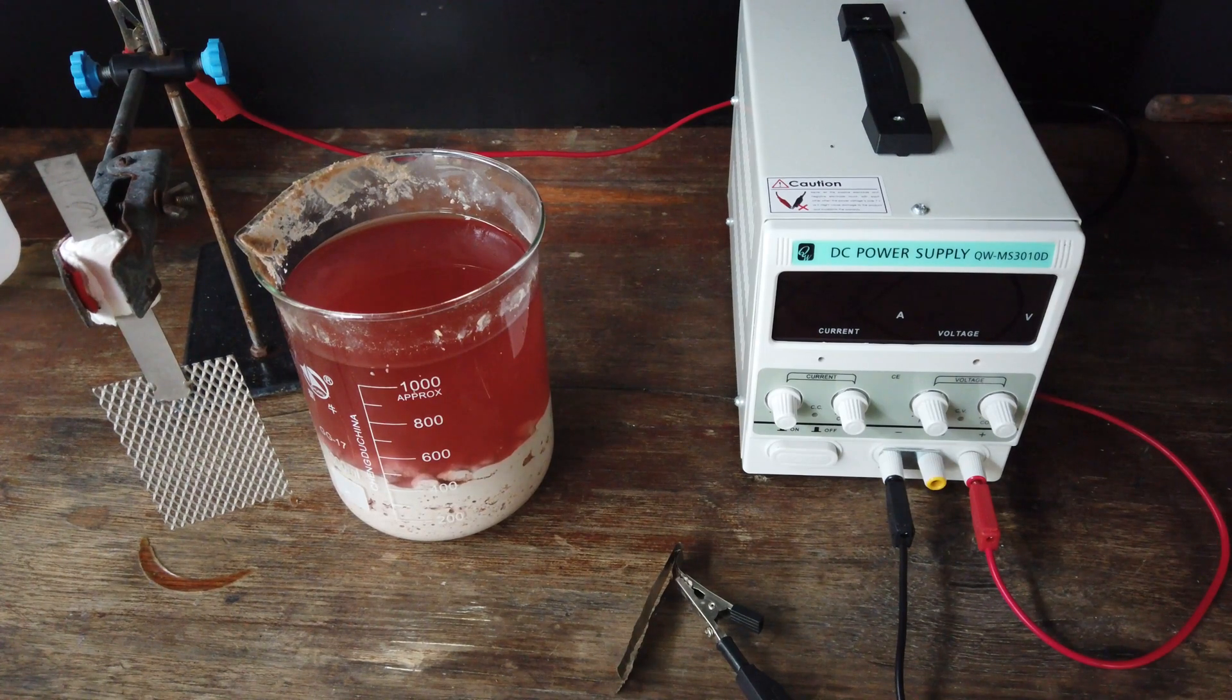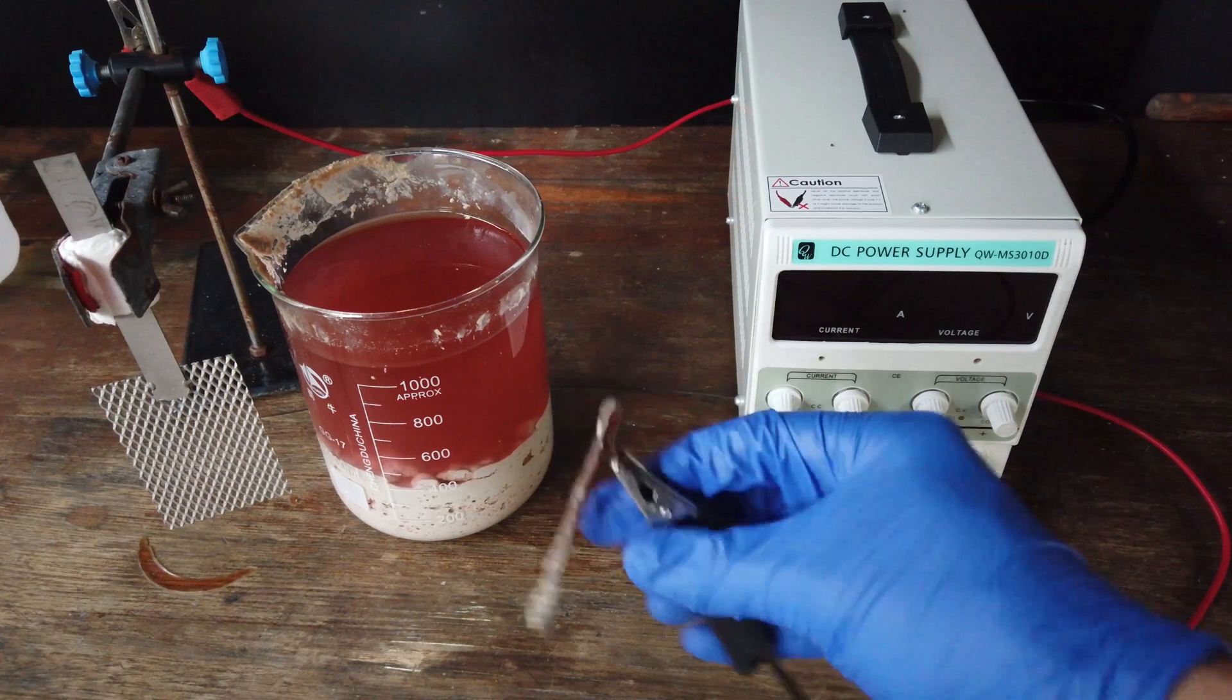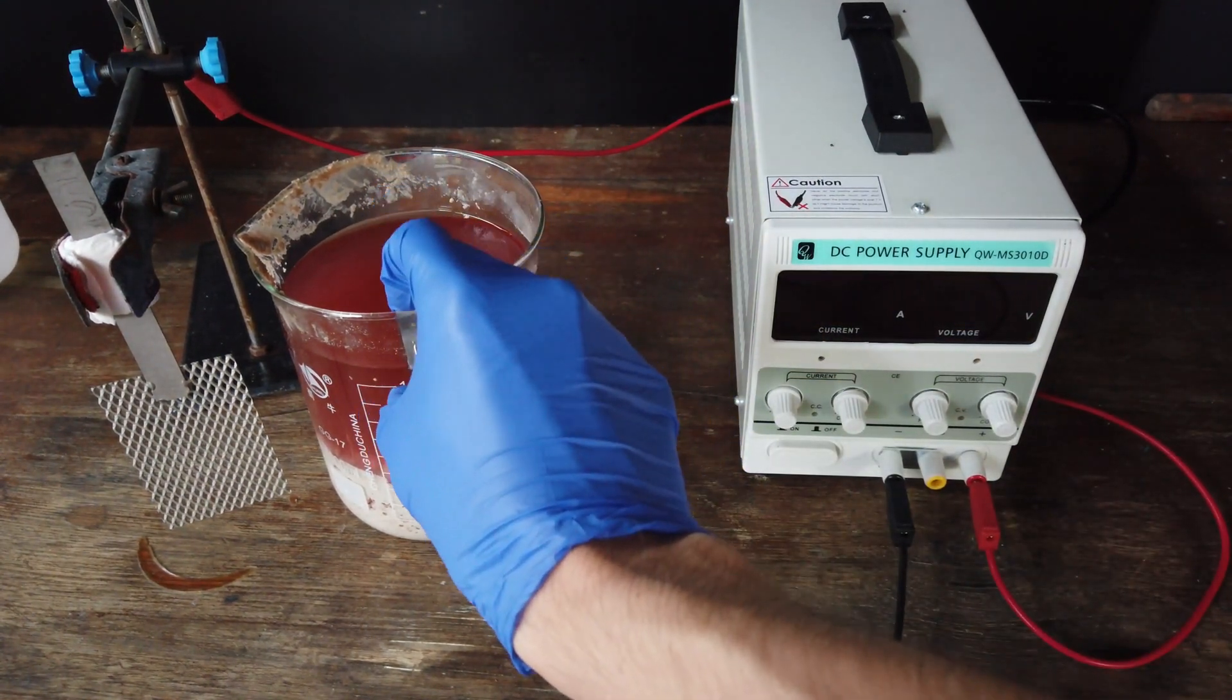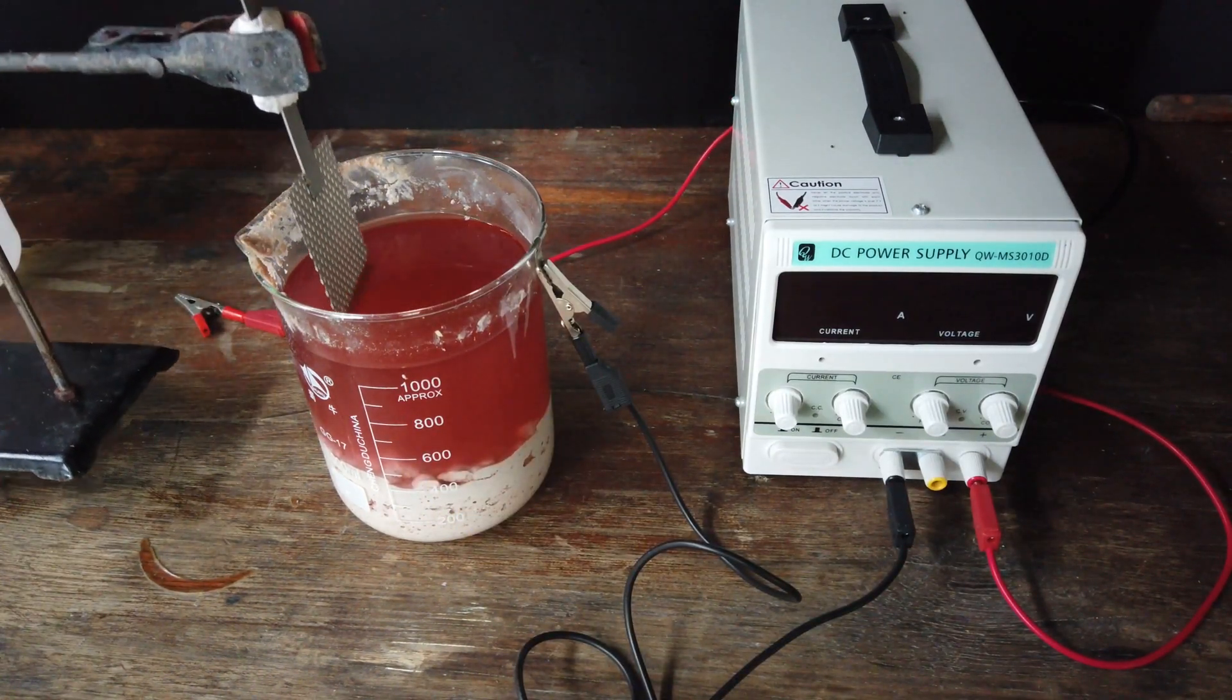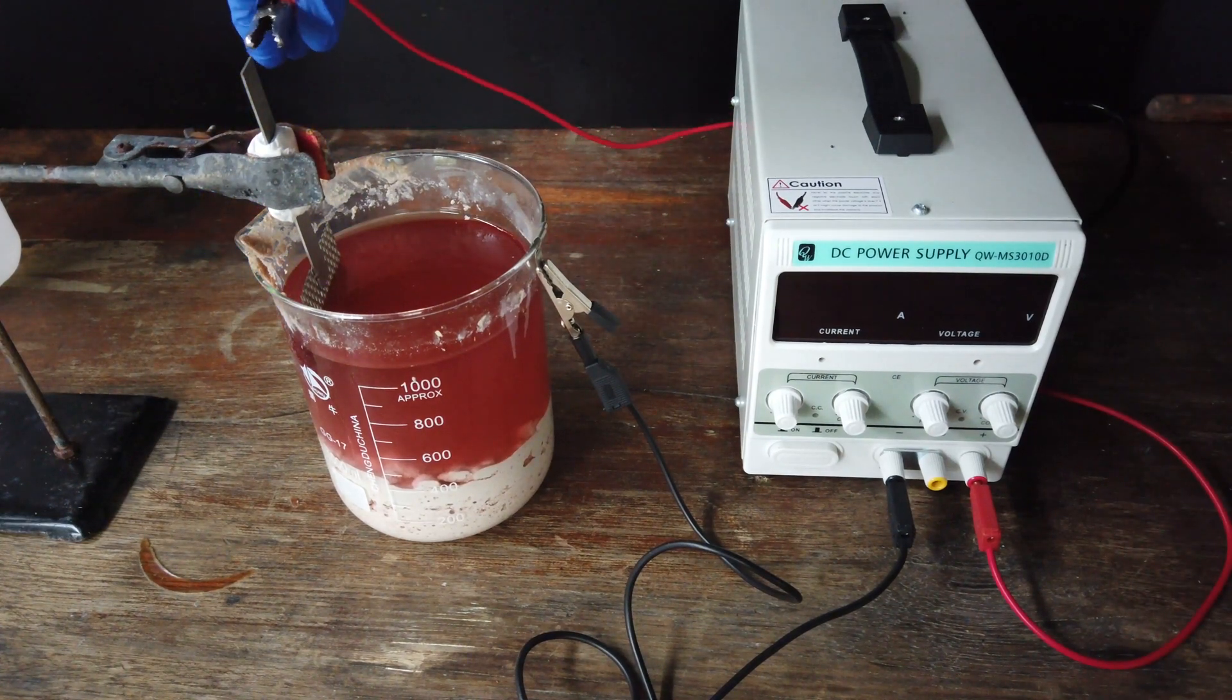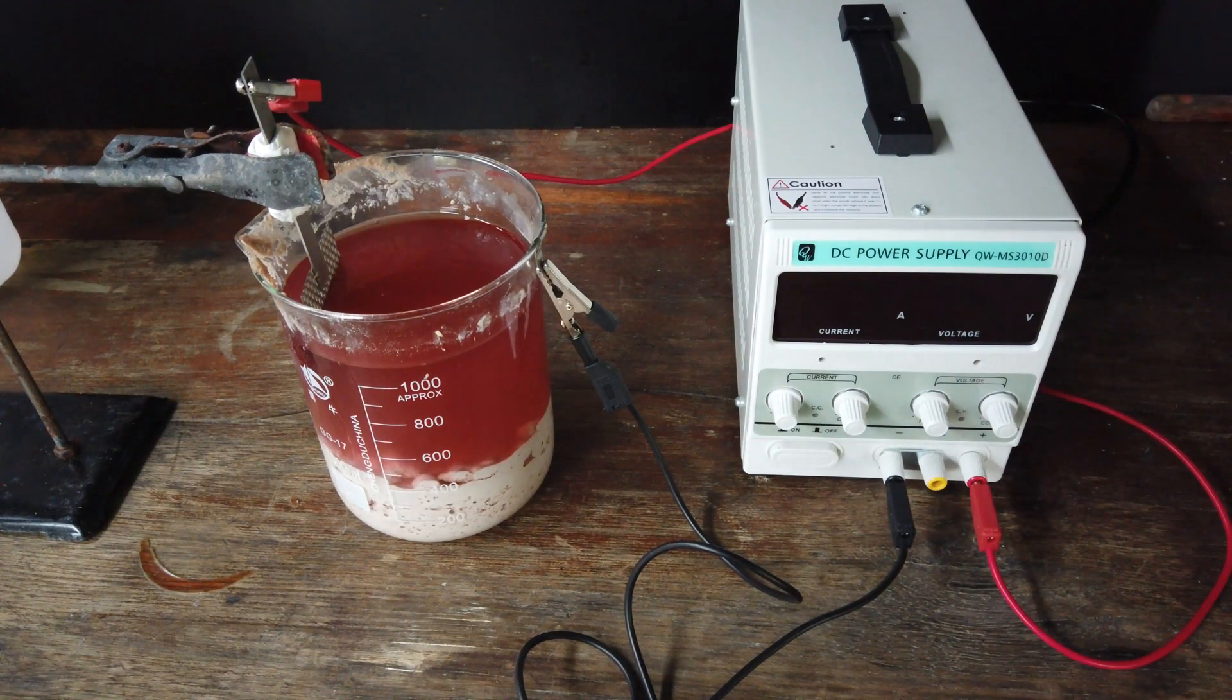Anyway, to electrolyse our nickel and cobalt out of solution, I have some nickel strips as the cathode. They'll sit in the solution just like that. And our platinum anode will be inserted into the solution like this. Connecting everything up. And we should be good to go.